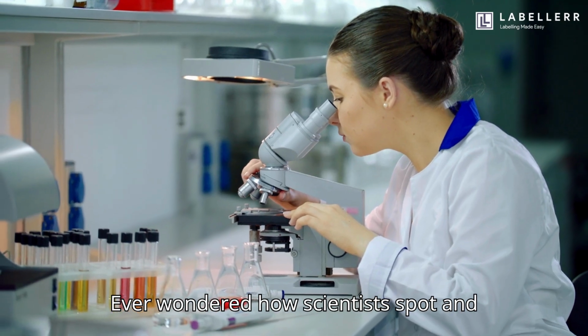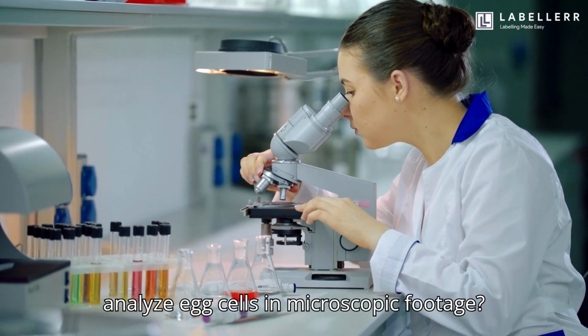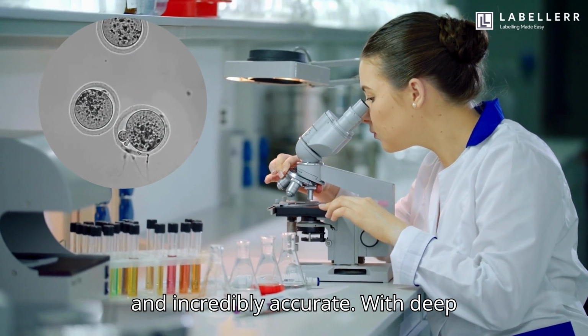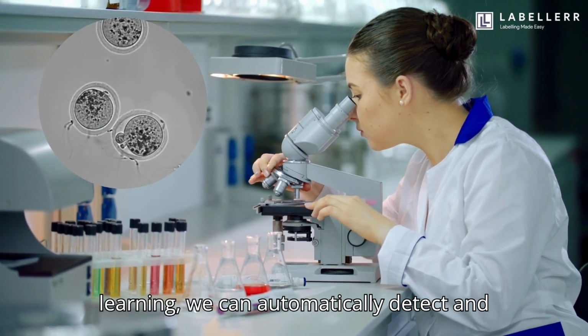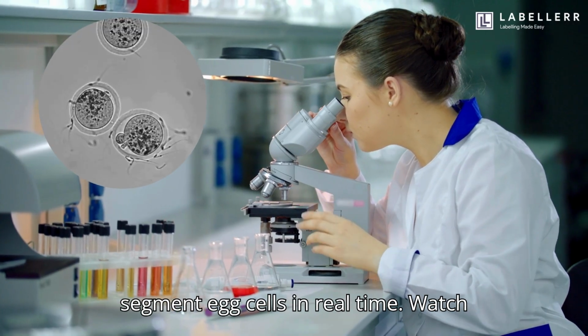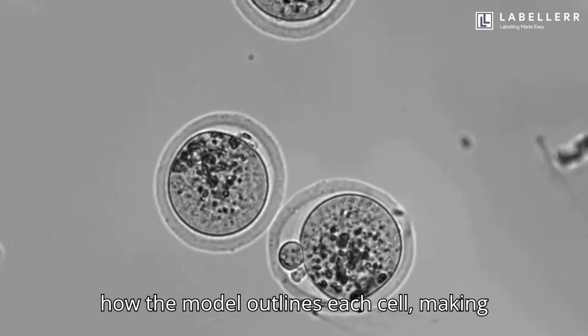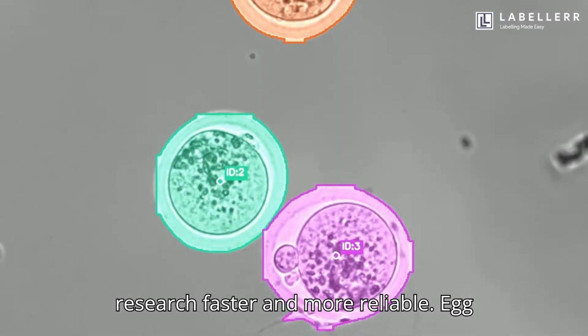Ever wondered how scientists spot and analyze egg cells in microscopic footage? Advanced AI makes this surprisingly easy and incredibly accurate. With deep learning, we can automatically detect and segment egg cells in real time. Watch how the model outlines each cell, making research faster and more reliable.